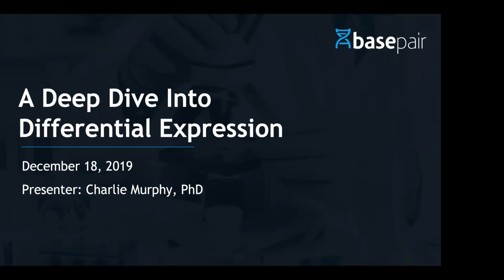A differential expression today, and we're going into the different steps up until you get to that, starting from your raw FASTQ reads up till trimming, the alignment, and expression quantification, and then finally into differential expression and what types of parameters throughout this pipeline that you should pay attention to get the most out of your data.